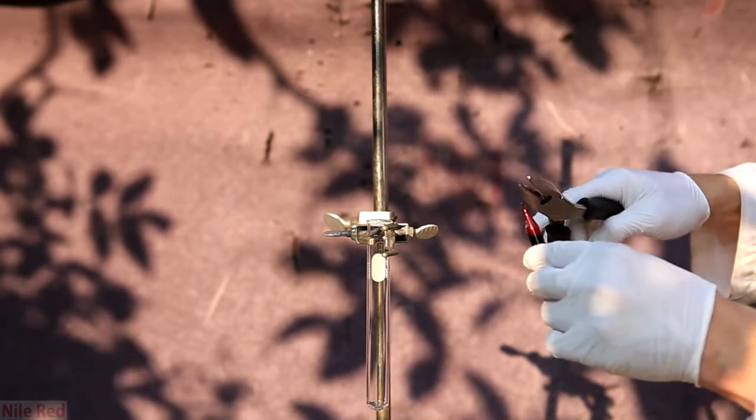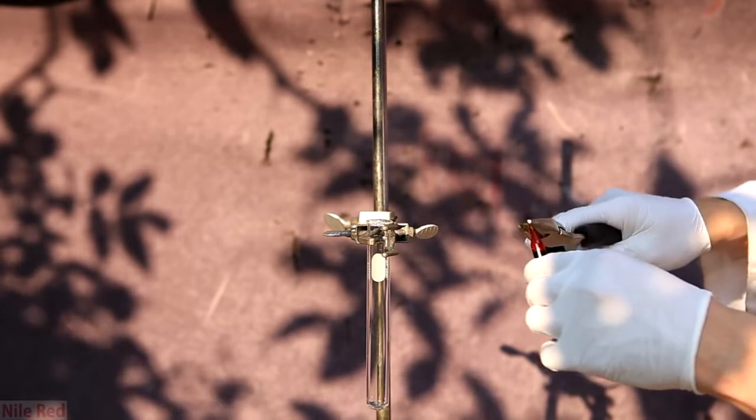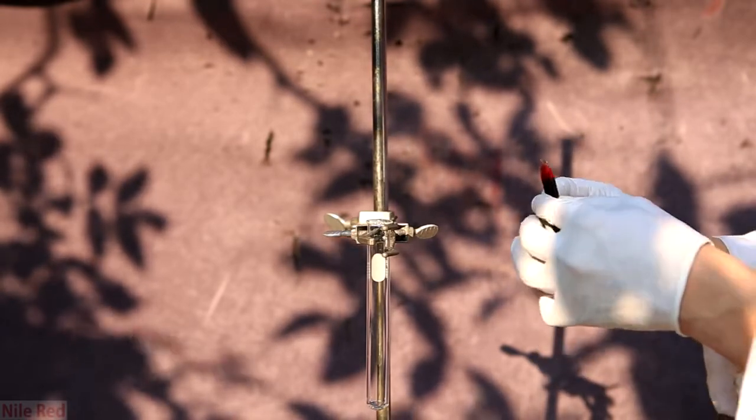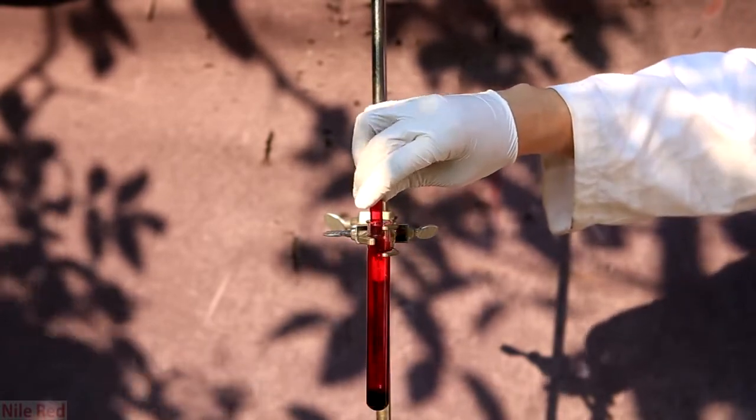To start, bromine is added to a test tube. This is bromine that was made in a previous video and it was stored in my homemade ampules. I show here that it can be easily opened by breaking it open with a pair of pliers.